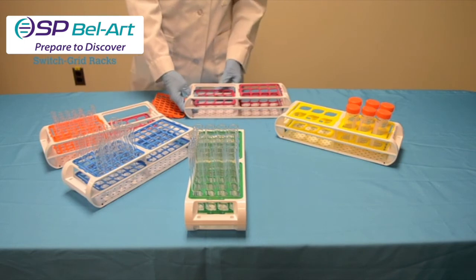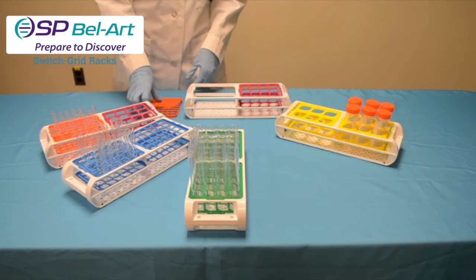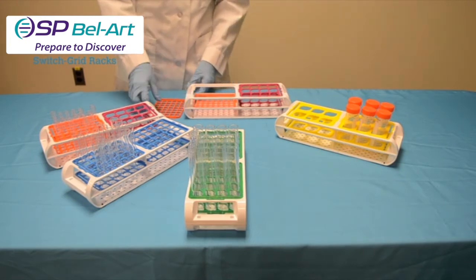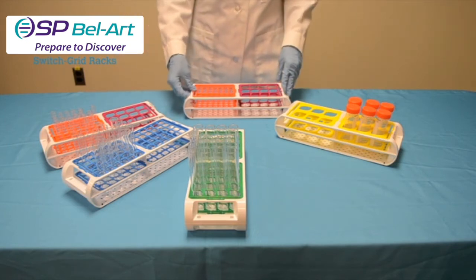To install, just insert the large tabs onto the center rib of the frame. Compress the spring latch or three small tabs towards the center of the rack, allowing it to drop into the outer rib. This process is quick and simple for any user.